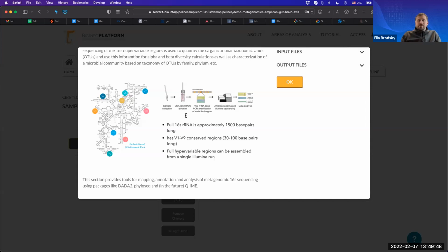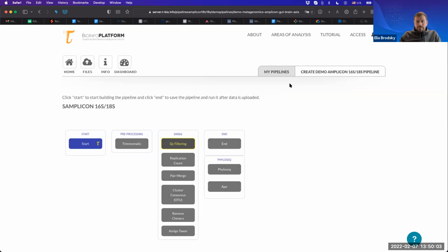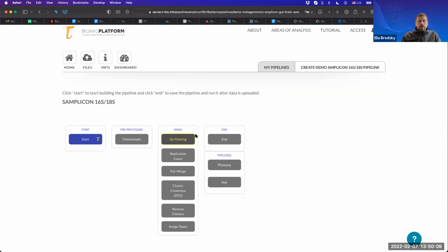You can see what we covered today, kind of what is being sequenced. The data to pipeline is specifically designed for paired-end metagenomic sequencing data for Amplicon 16S ribosomal RNA. Here, the 16S ribosomal RNA hypervariable regions are being sequenced, not the full gene. One of the objectives of this pipeline is to denoise the actual sequences. The more precise the sequences that we have, the better we will be able to match them accurately to the reference database. And if we have an accurate match, we can then also analyze differences in composition, or maybe how they are related to each other phylogenetically.